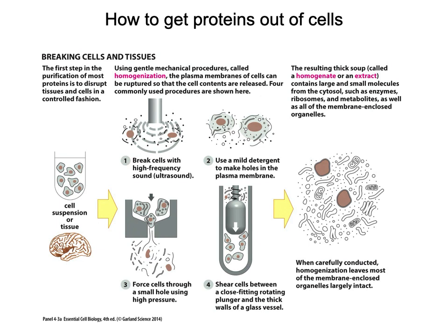Okay, so again, method 2 and method 4 are the most common ones that you would see in a lab to do that. And again, usually it would be a combination of the two to really ensure that you're getting good lysing, breaking up, grinding up of the cells.